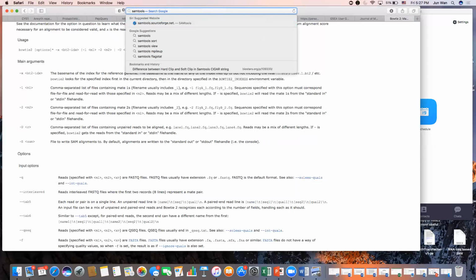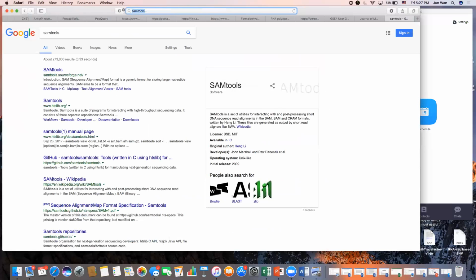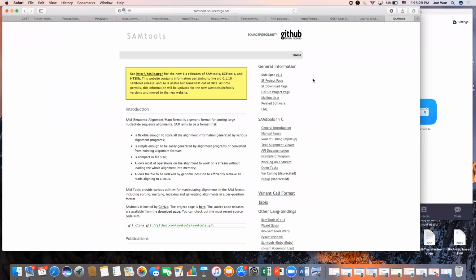Now, do you guys remember the output of the aligner? What file should we be expecting? What's our output? A SAM file. Absolutely right. You're going to take those 2 FASTQ files for control and make one SAM for control. You're going to take those 2 CTCF treatment files and make one SAM for CTCF. Those are the 2 things that we're going to move on with and turn into BAMs. You're going to like SAMtools. Let's do some documentation. Let us see.